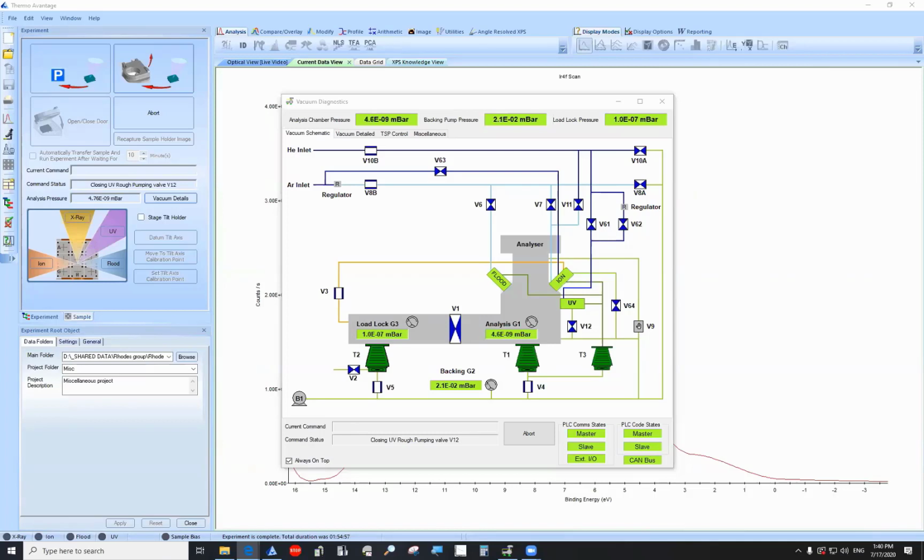And then one important thing to keep in mind is that please don't put anything that's going to create an additional vacuum or outgassing load in the chamber by utilizing adhesive or any kind of tape on the top plate. If you really need to move your material into the system on some sort of an adhesive backing, then I would ask you to put that on a glass slide and then affix the glass slide to the top plate. So I just don't want any sticky residue on these things that will compromise the vacuum.